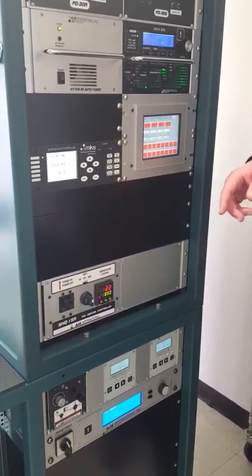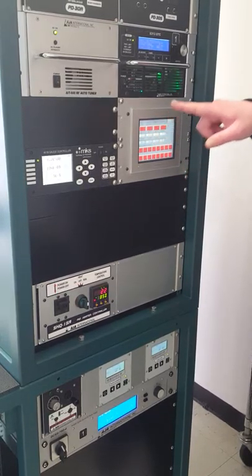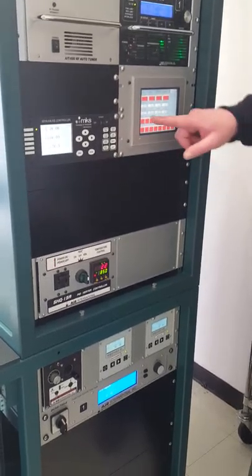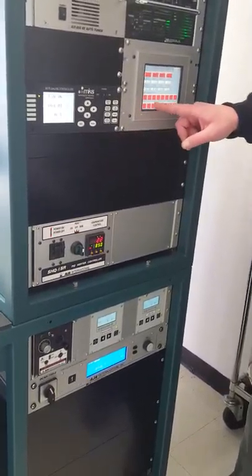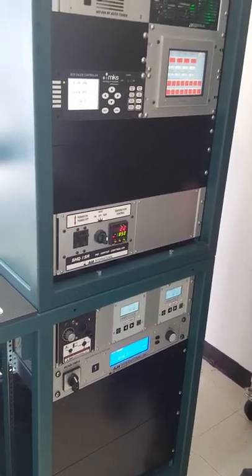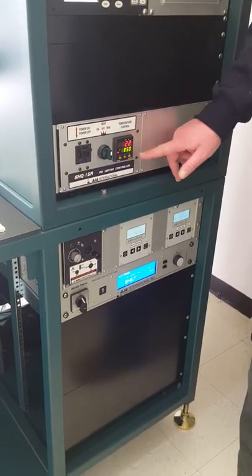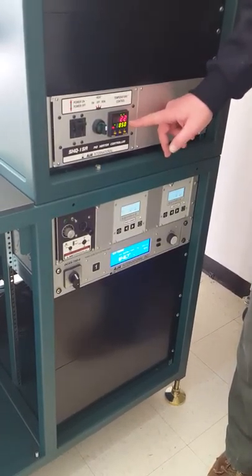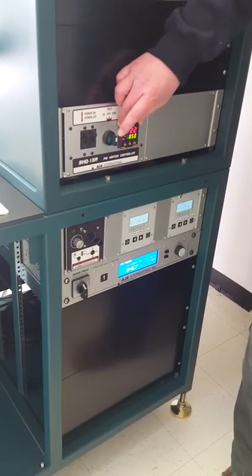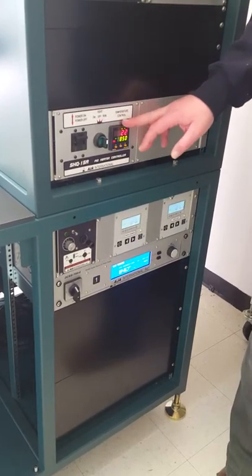The touch screen is used for controlling the pneumatics. We can set our gas flow here and open up the isolation valve. It also controls all the shutters on the sputter guns, and there are extra buttons if you add anything to the system. It also has the heater controller — controlling the lamps, the power supply portion, and the PID control portion for stabilizing the temperature.